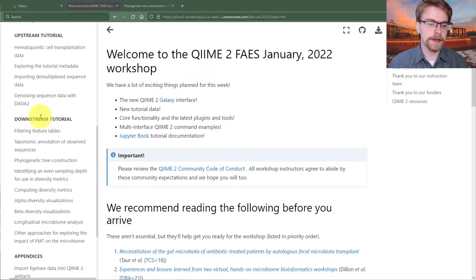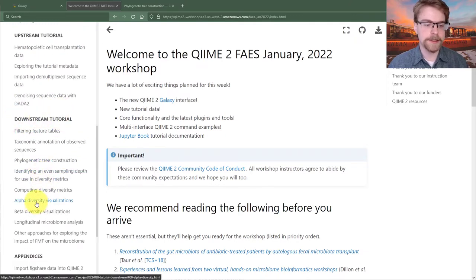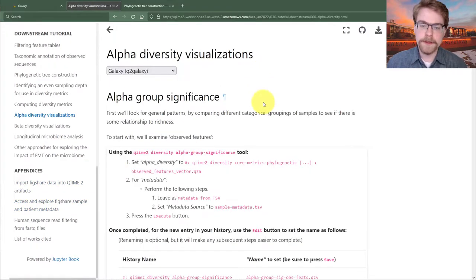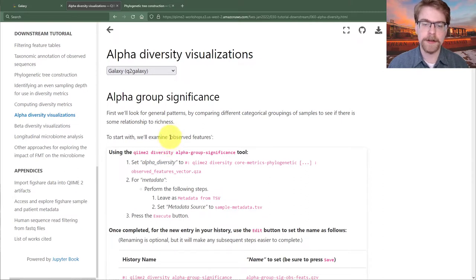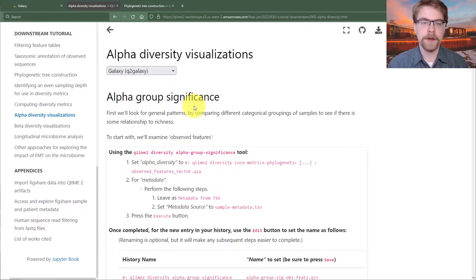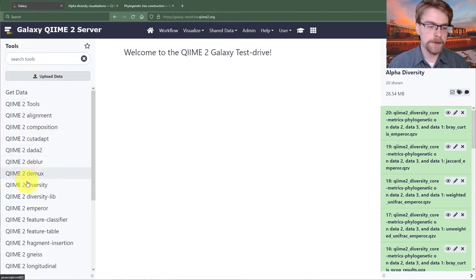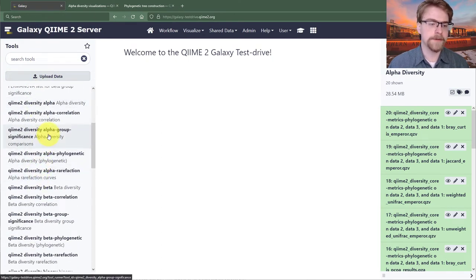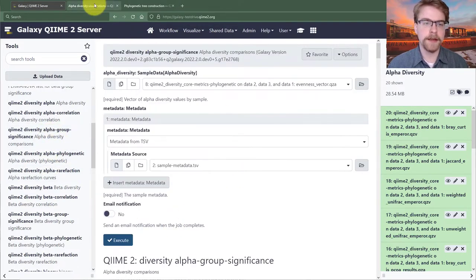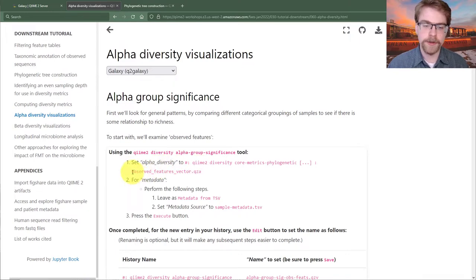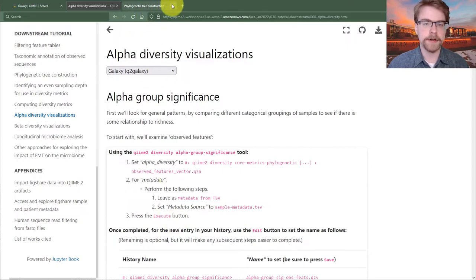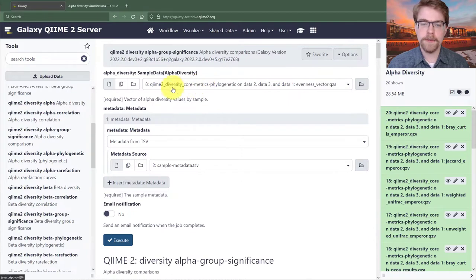First, I'm going to go to the downstream tutorial and select alpha diversity visualizations. One of the first steps we might be interested in is seeing if there are any general patterns. We'll do this with just richness, called observed features in QIIME 2, using the QIIME 2 diversity alpha group significance tool. Going over to Galaxy, I'll click on QIIME 2 diversity alpha group significance. The instructions say to set alpha diversity to the observed features vector of core metrics phylogenetic, and for metadata, set it to just our sample metadata, then press execute.